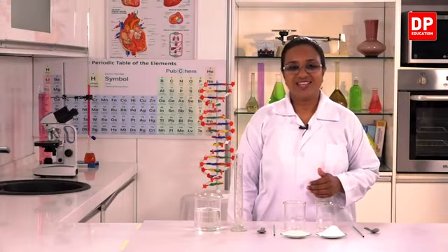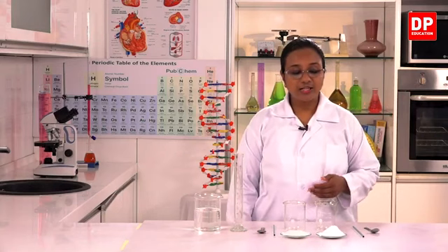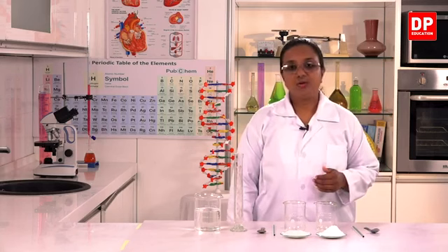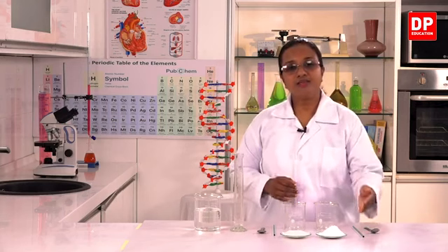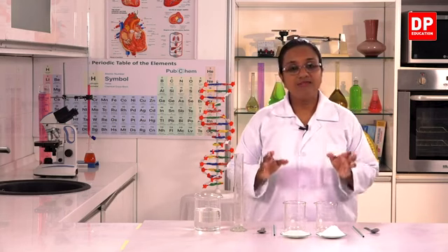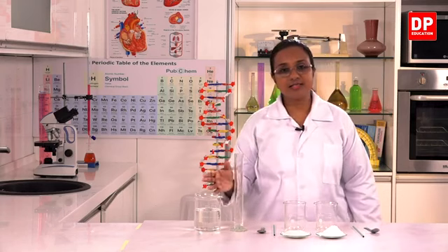Okay students, now again we are going to observe the effect of nature of solute on solubility. So to do that, we have two different solutes. One is sugar, the other one is salt. And we will have to take equal volume of the solvent, that is 50 centimeter cubes of water.